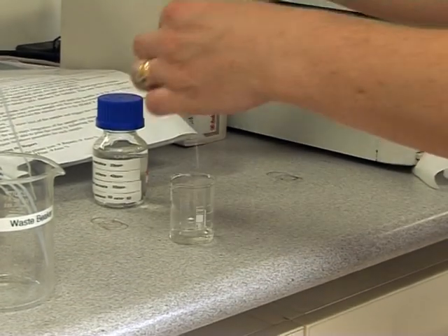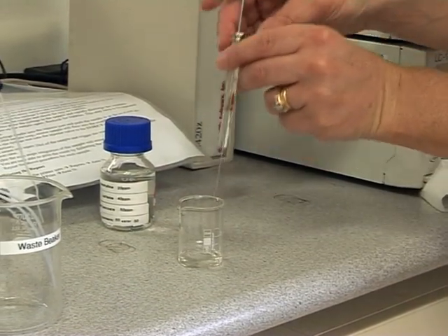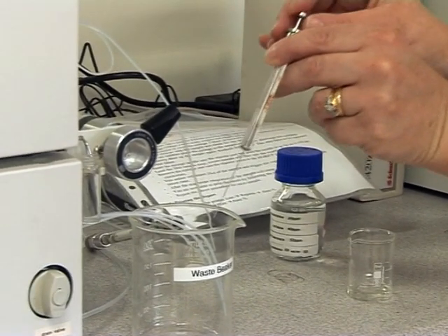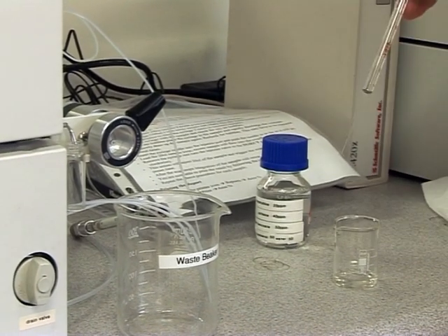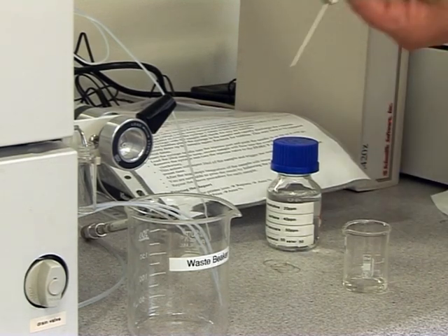Place the tip of the syringe into the solution and draw up the plunger slowly to collect about 50 to 60 microlitres. Expel the solution into a waste beaker by pushing the plunger down. Repeat this process another 2 times to ensure the syringe is thoroughly rinsed with the sample.